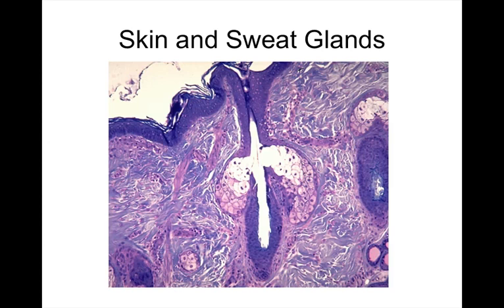Oh, okay. Great. So what am I looking at here? So this is a slide of a hair follicle, and you can see the sebaceous glands wrapping around the follicle itself, kind of in that donut shape that we talked about in class. Yep. You promised sweat glands. Where are there sweat glands here? Are they down at the bottom? You can see them kind of cut here a little bit. It's actually a little bit funny. There's some over here in this corner.